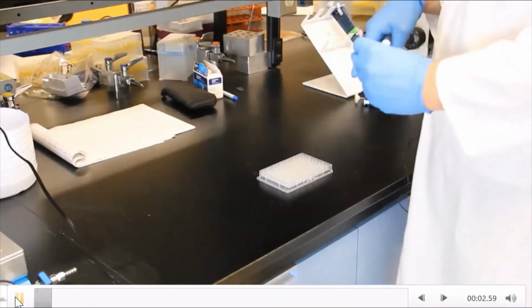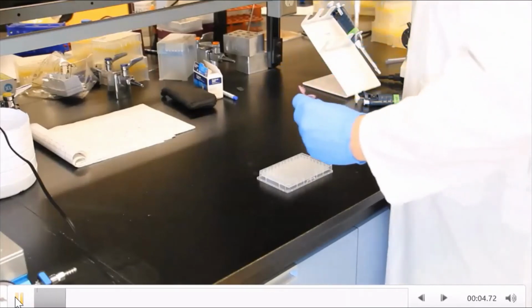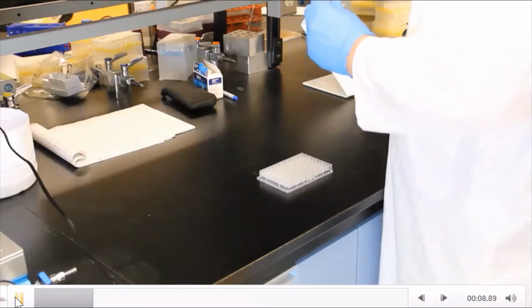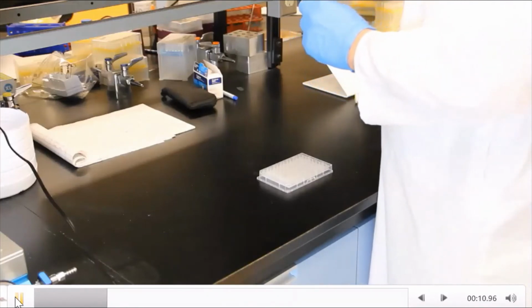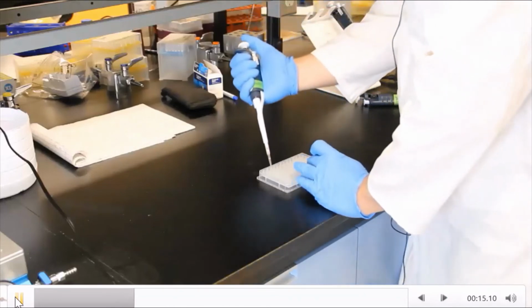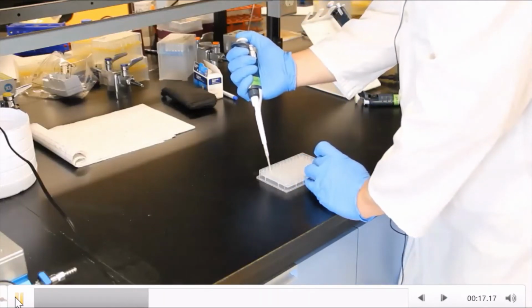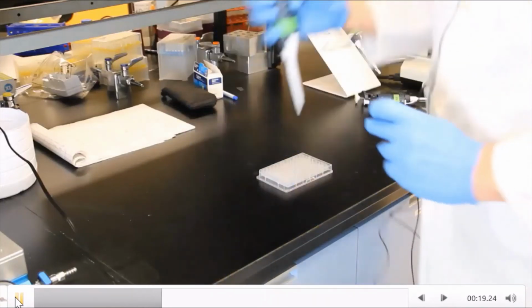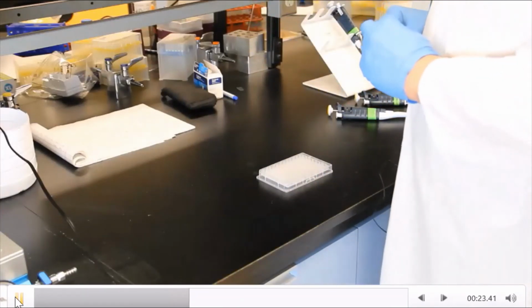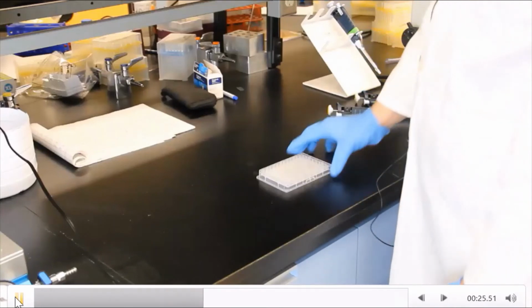So now we're going to do a high throughput method to test for our therapeutic agents and whether we get the results that we're expecting for infected red blood cells. So now we would take our samples of interest, load them into our wells. At this point, they have a standard glucose concentration that we know in the media. What we're looking for is a change in this glucose concentration.